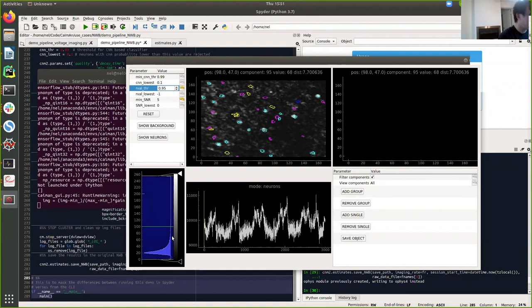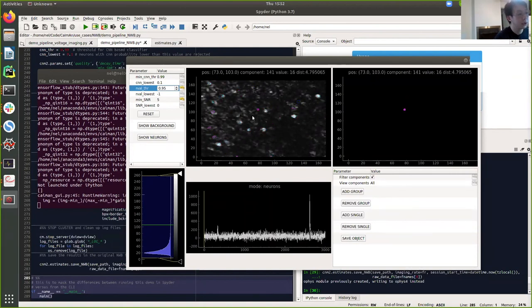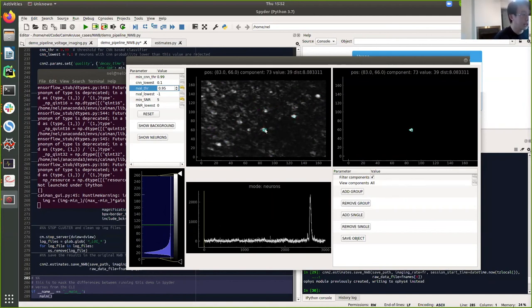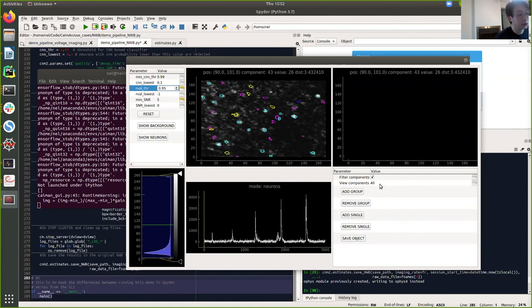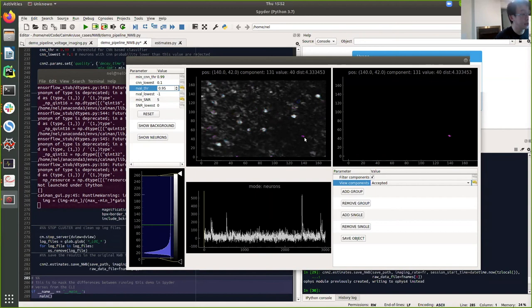And next, I can show you guys the GUI for selecting neurons. We can choose the result to be HDF5 or just NWB. So here we see the GUI. In the middle, we can see the neurons laying on the image with neurons on it. And you can select neurons and see what's the signal of this neuron. You can also see the background. What's the background of this video. So for this video, we choose two backgrounds. But you can also set the number of backgrounds as you wish.